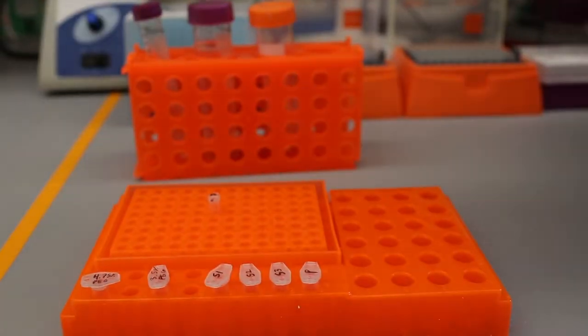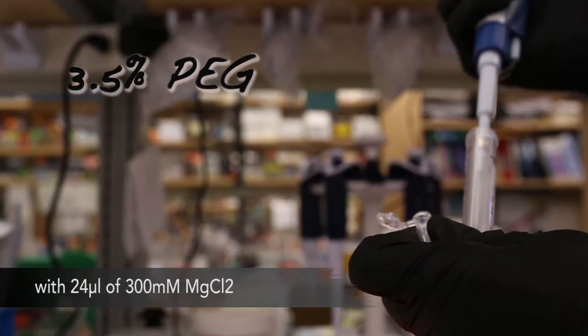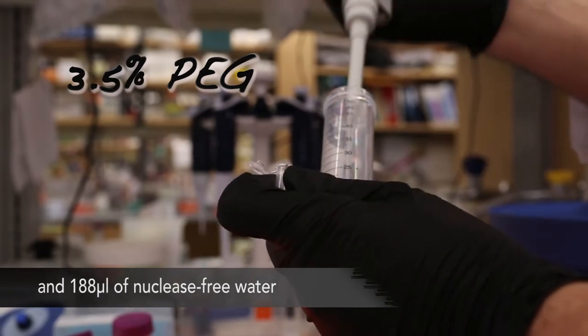To make a 3.5% PEG solution in 30 millimolar magnesium chloride, mix the following: 28 microliters of 30% PEG stock, 24 microliters of 300 millimolar magnesium chloride, and 188 microliters of nuclease-free water.